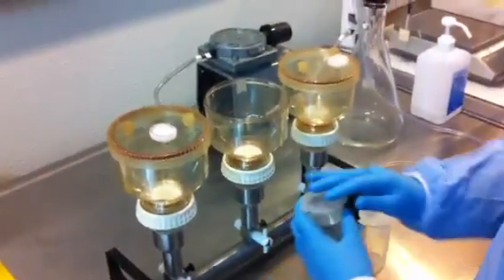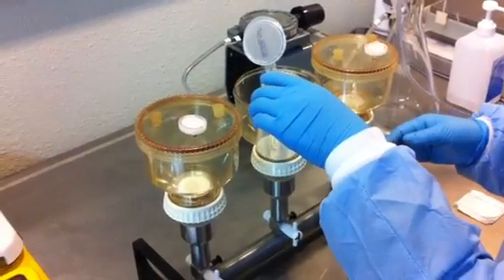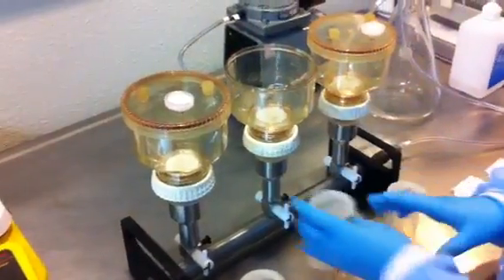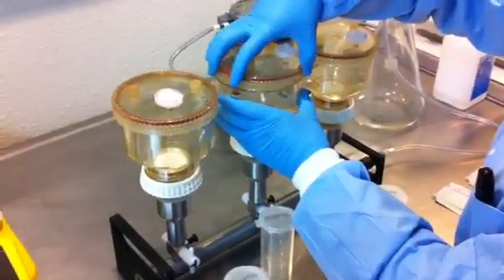Here we are adding the next dilution vial. Once all the solution is added and we turn on the pump, it's going to pump through the filter, collecting the bacteria on the membrane filter for testing.